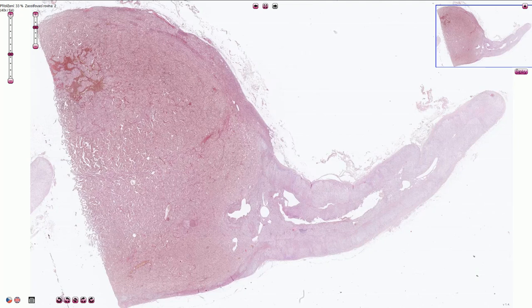This is an adrenal gland. On the right side of the slide there is a normal adrenal gland with preserved architecture and on the left side there is a tumor of the adrenal medulla called pheochromocytoma.